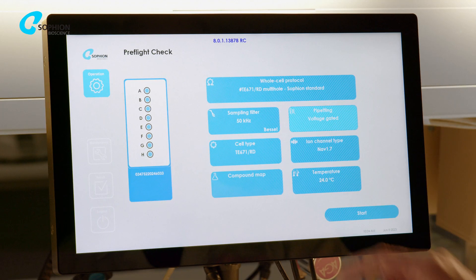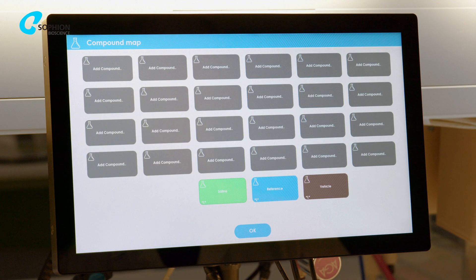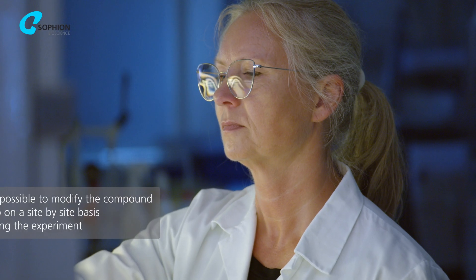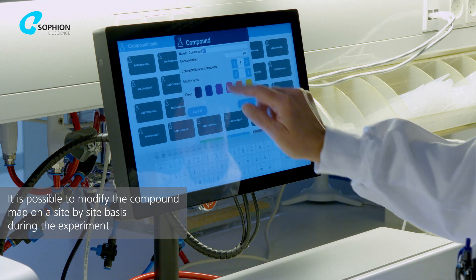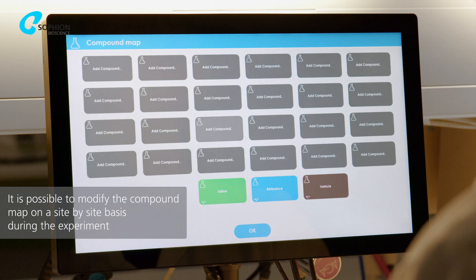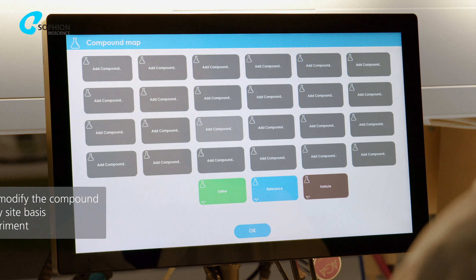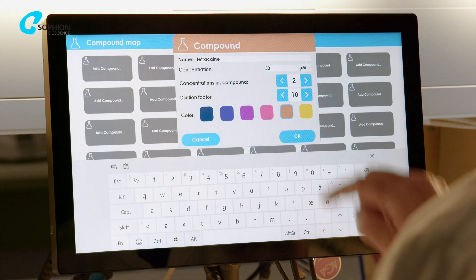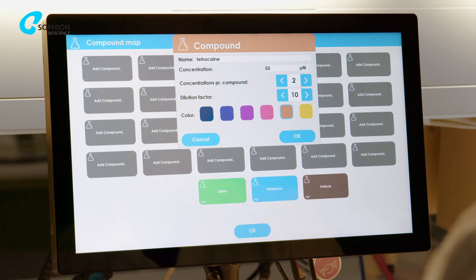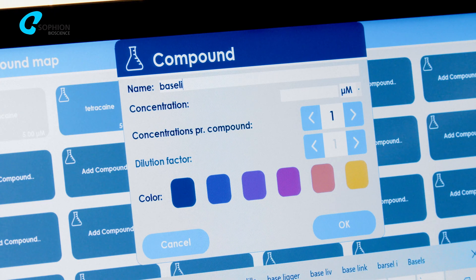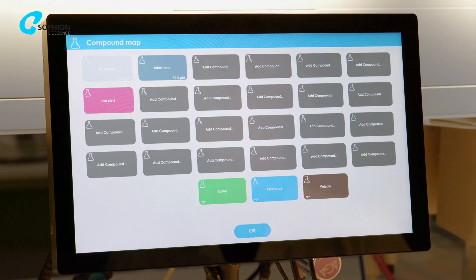Select the compound you plan to add during your experiment. You can add new compounds or set up a concentration response of the same compound. You can also use the preset buttons to select saline, vehicle and reference additions. Specify stock concentration, number of dilutions and dilution factor, and flag it with your desired colour. It is also useful to label one button 'baseline', to use when running a voltage protocol without adding any liquid.